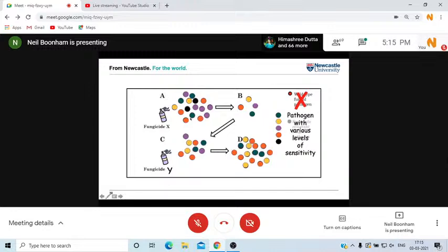And it's these populations that we want to be able to detect. So our work here, or Yaitha's work here, was to look at these populations using high-throughput sequencing to see whether we could figure out who is in these populations, so which haplotypes are present, and also how many of the different haplotypes are present. And finally, to see whether we could do that quickly so that we could look at a population like this.